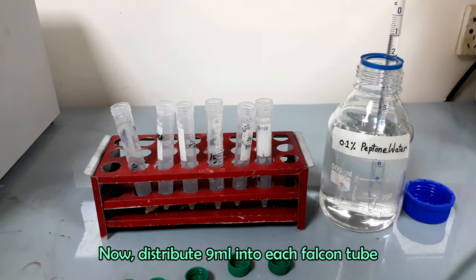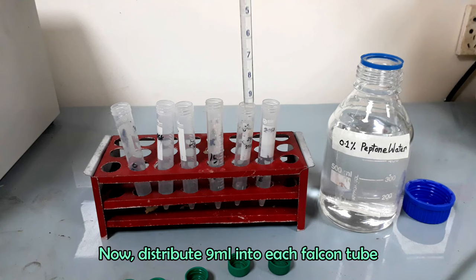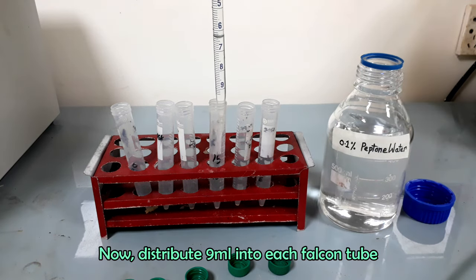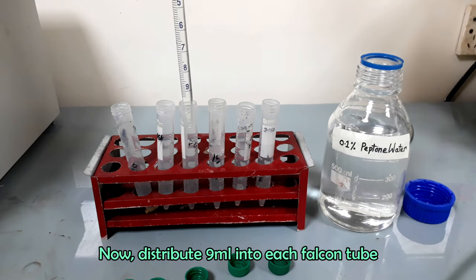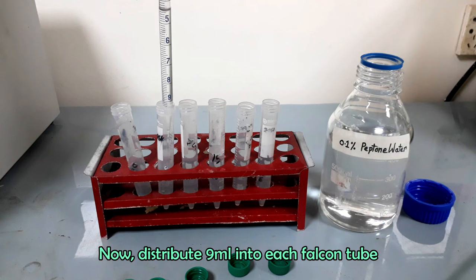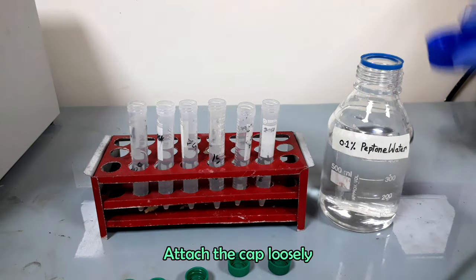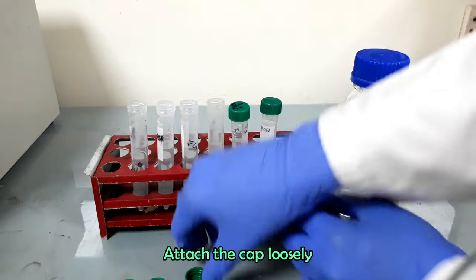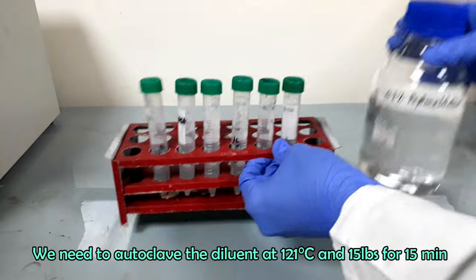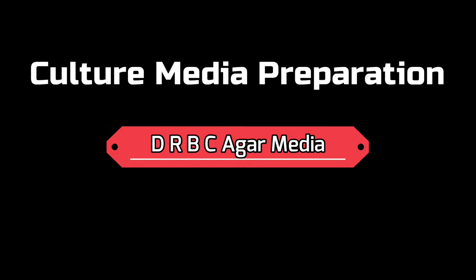Now distribute 9 ml into each falcon tube. Autoclave the diluent at 121 degrees Celsius and 15 pounds pressure for 15 minutes. Now we will prepare DRBC agar plate.